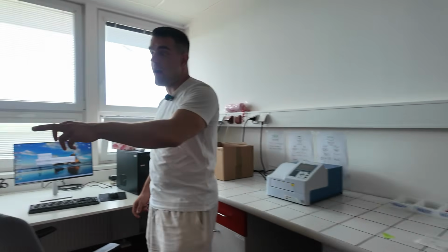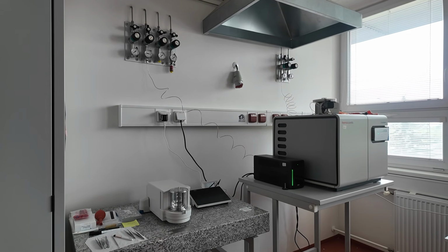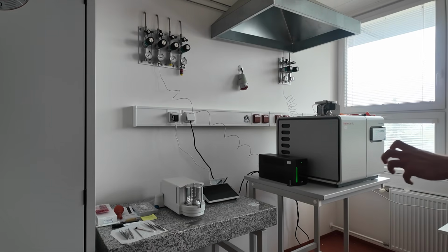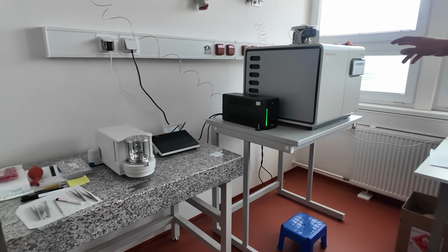And we have the microscales here. They are super fancy. I think it was like $30,000. It can weigh down to micrograms, and it's a complete pain to work with. And this is the CHNS, the combustion machine.